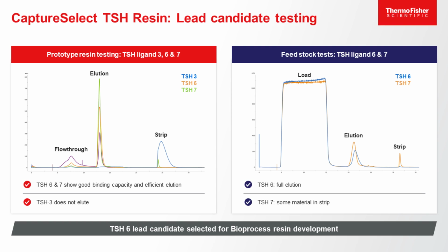What we then did was actually test with feedstock. So we tested the same ligands, but then with feedstock, and demonstrated that TSH6 and 7, although both worked, still TSH7 had some material in the strip, and TSH6 actually gave full elution.